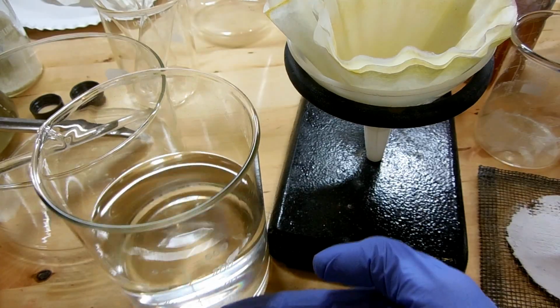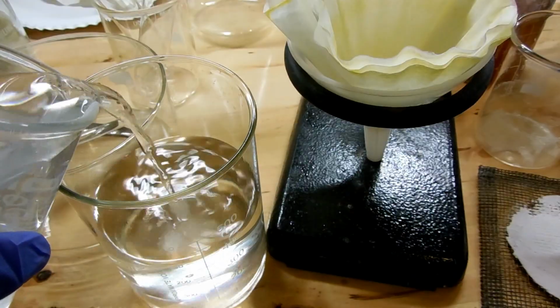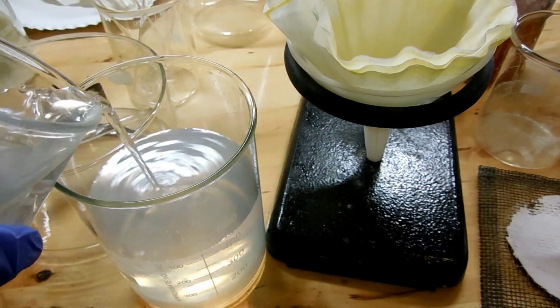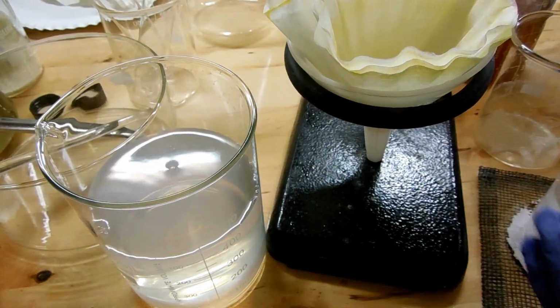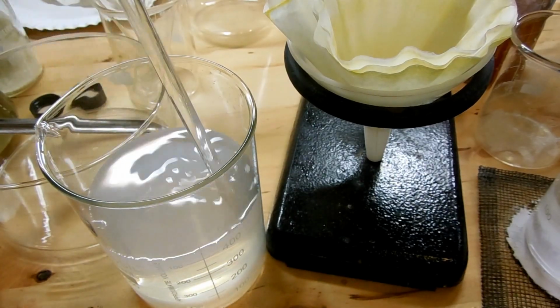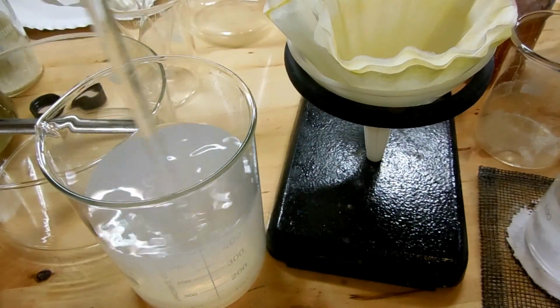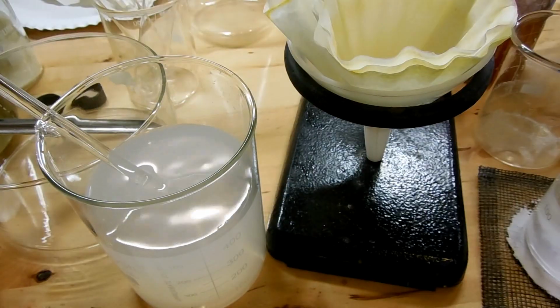Like this is my solution here. So it's water clear right now, but we'll add this and look at that. See how it goes milky? That means there was a little bit of lead dissolved in there as the lead iodide. So when we added the bicarbonate, that transformed it into lead carbonate, which is really insoluble. So that's a good thing that we did that.